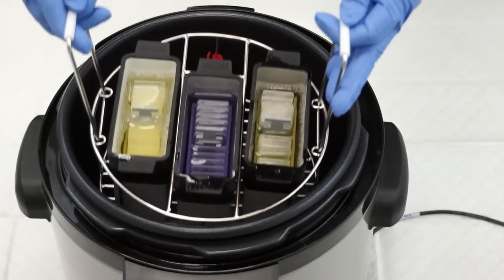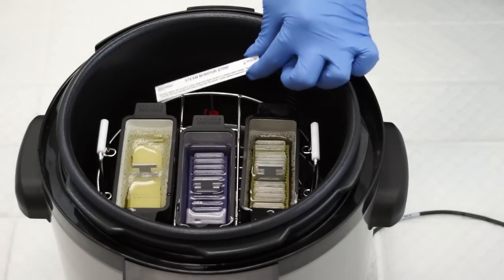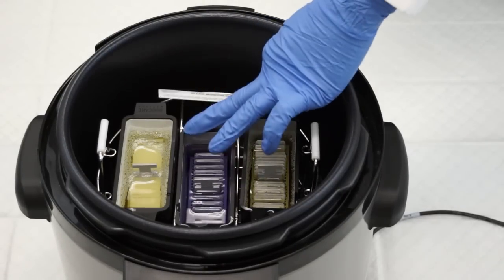A steam monitor strip placed inside the unit will turn dark gray or brownish black when exposed to temperatures over 100 degrees. When using a steam strip, carefully place it inside the unit, ensuring that it does not fall into the water.